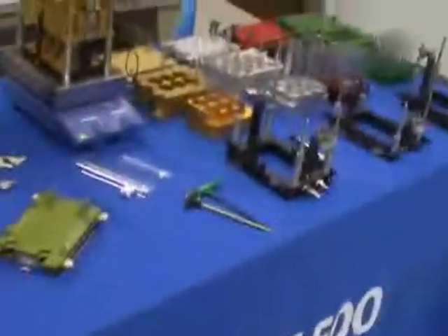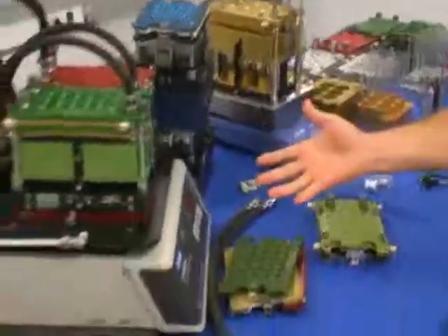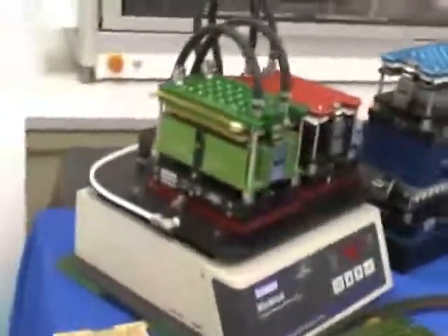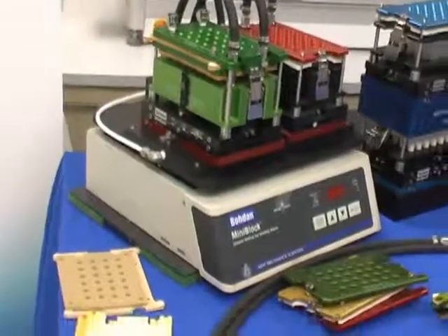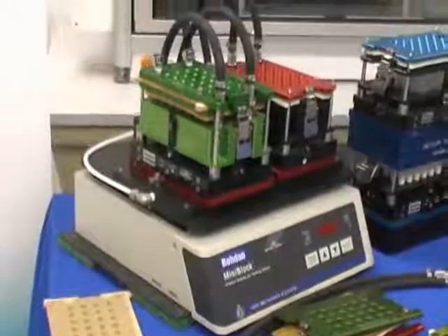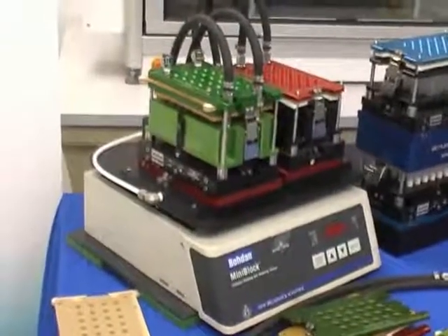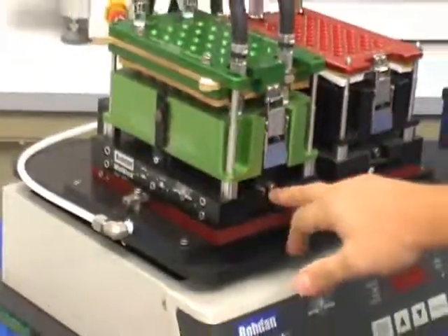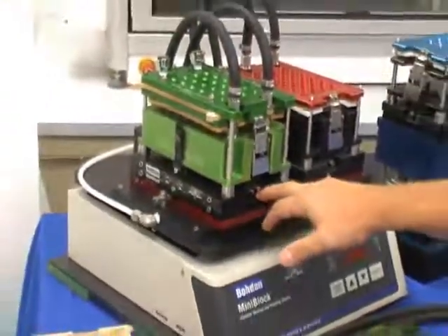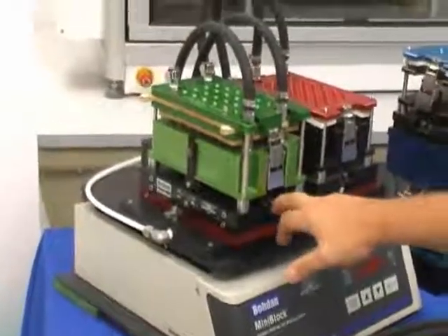Basically what we have here is the mini block product line, which is designed primarily for reactions that require filtration or reactions that take advantage of using filtration in the process. The reactions are done in reactor blocks that are basically designed as a valve body, which holds a tube that acts as a filter.